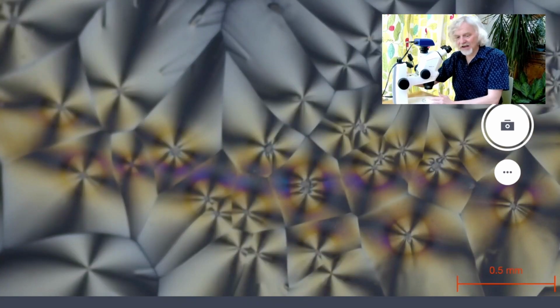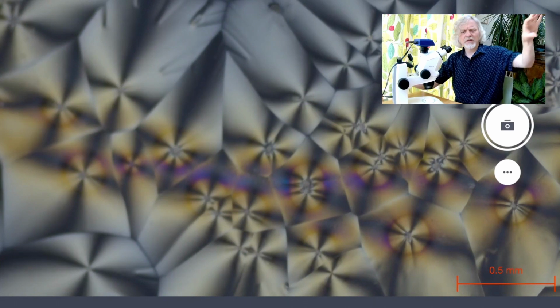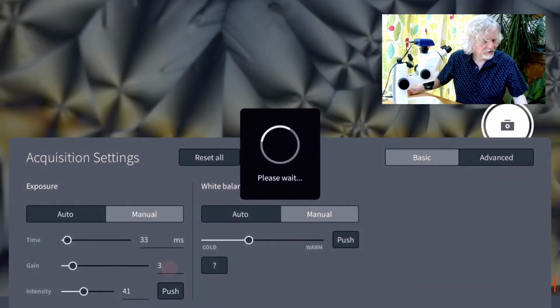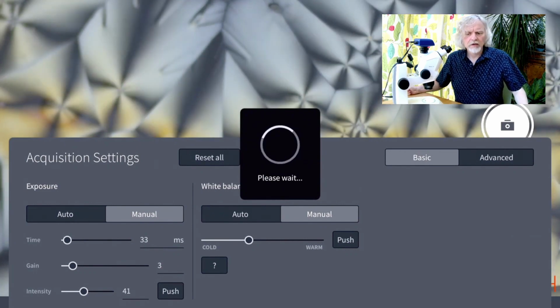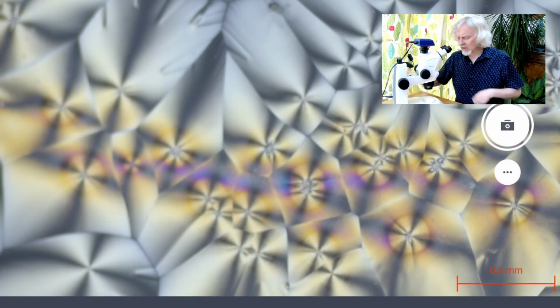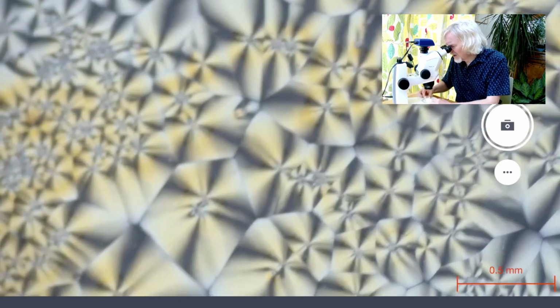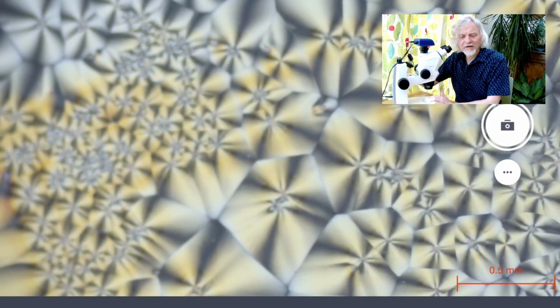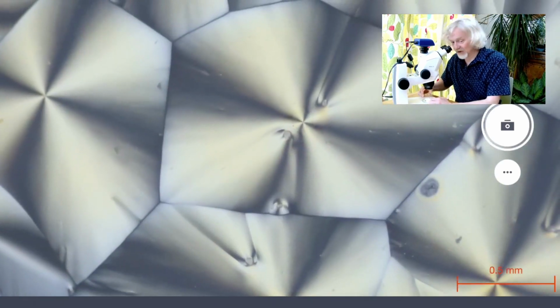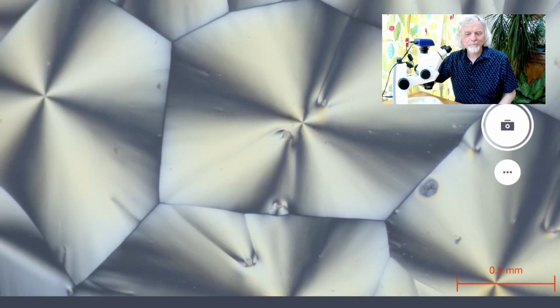And if I zoom in, there are some colourful patches. Like there's a little nice colourful patch just there. Look at that. Sort of almost like a Milky Way going across. And again, I'll just do the colour balance a little bit. There we go. And you get these amazing crystals, or really tiny, tiny ones there. Focus. And then really massive, big crystals there.